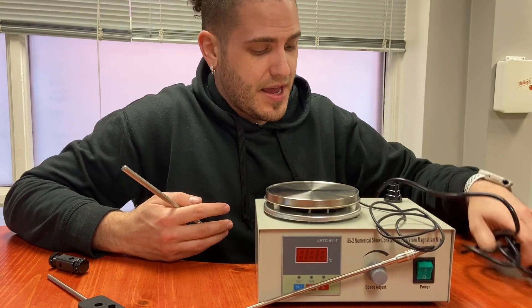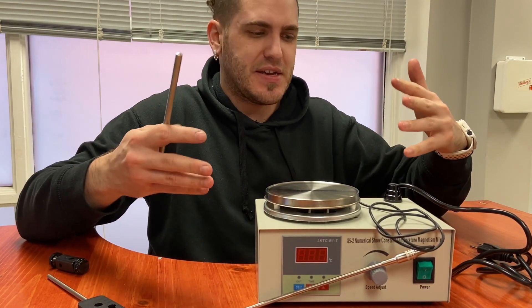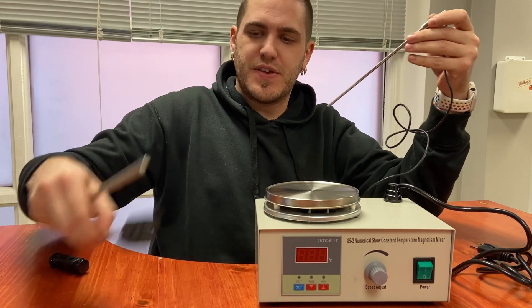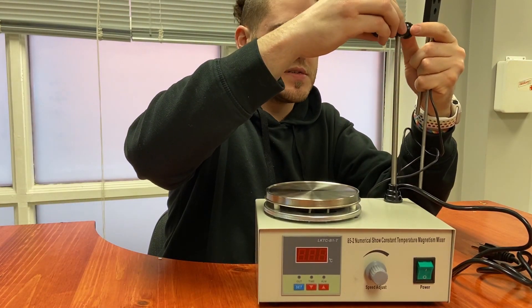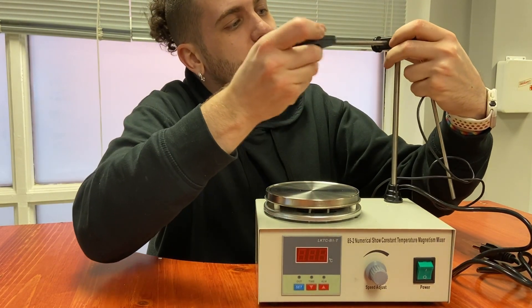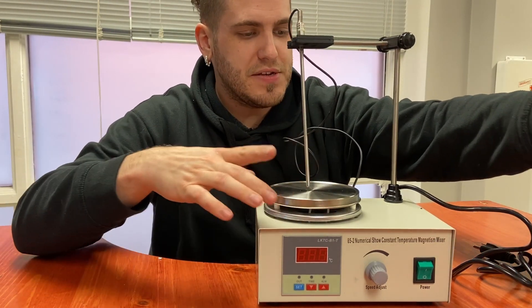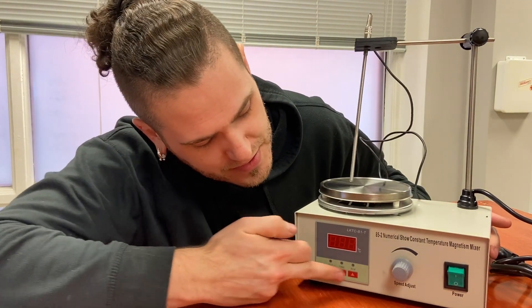This is the little unit and I am pretty impressed. It's kind of generic looking — very lab-grade. It doesn't have any fancy LEDs or RGB whatnot; it's just simple and it works. This is a temperature probe, which goes onto this kind of tower thing which gets screwed in here. And then there's a little adjustment thingamabob. It's all calibrated here on this little thing, and the temperature probe tells you what it is.